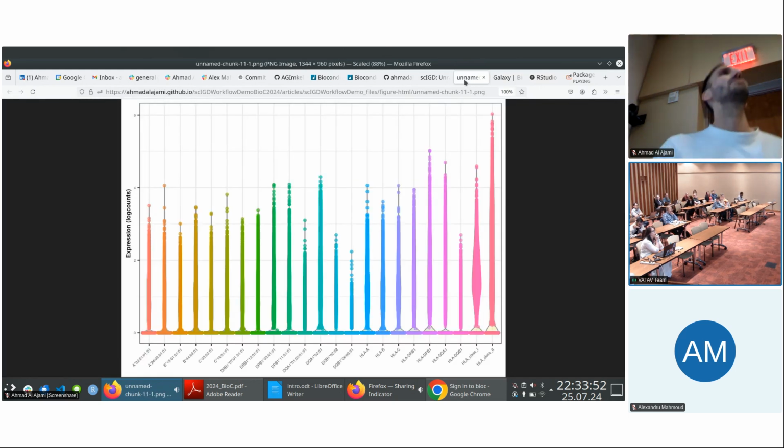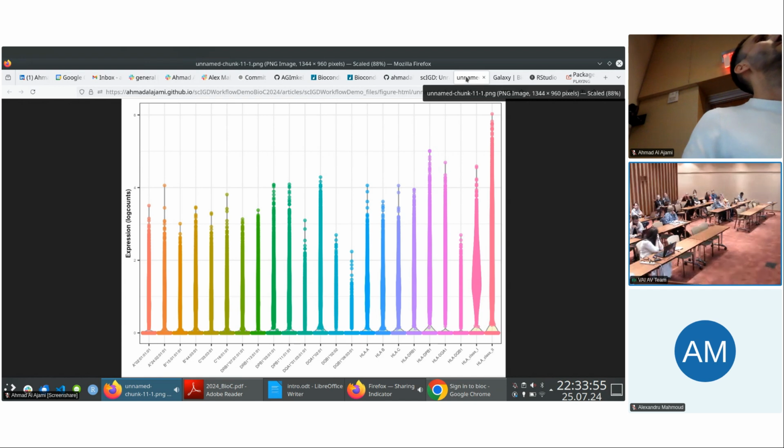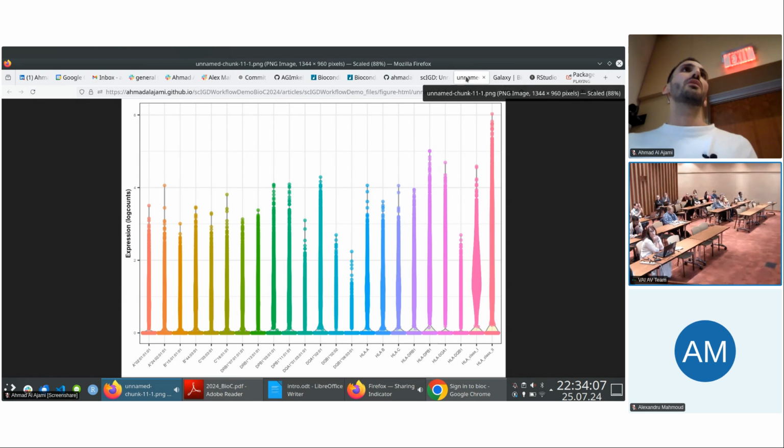How do you deal when sometimes there are multiple typing result possibilities? They give you more than two possibilities. They report different percentages, by confidence, for which two got the best result from the model. So they give you a list of many alleles, but then they choose at the end the one with the highest percentage. This is what you get as the two alleles. Sometimes it's one allele, but they do maximum two. They align to so many different alleles, and the ones with the highest percentage that fit the model best are what's reported.